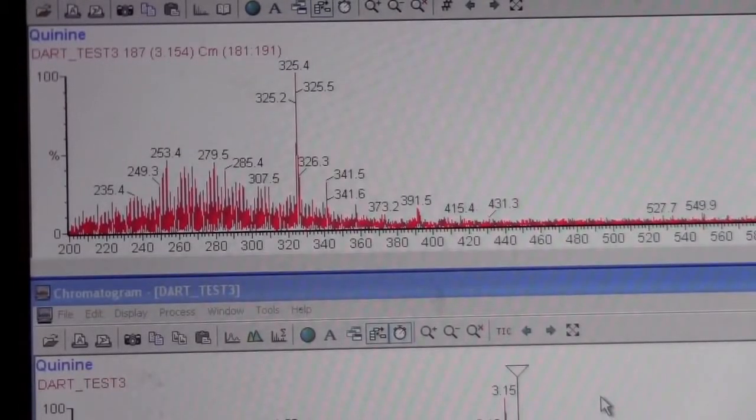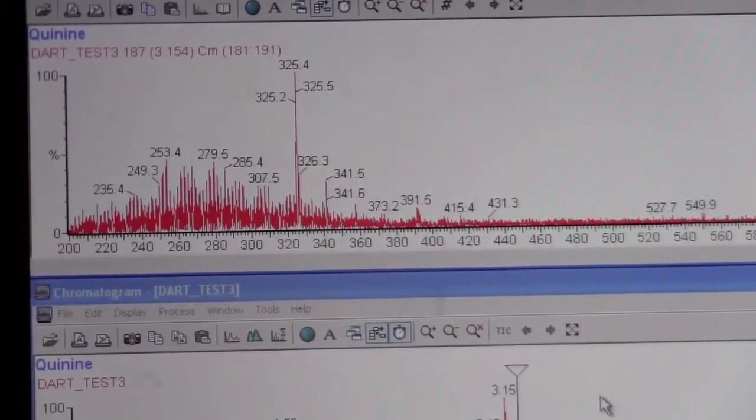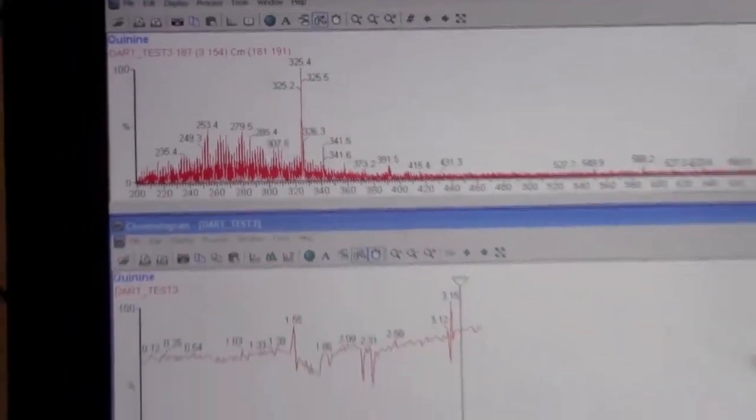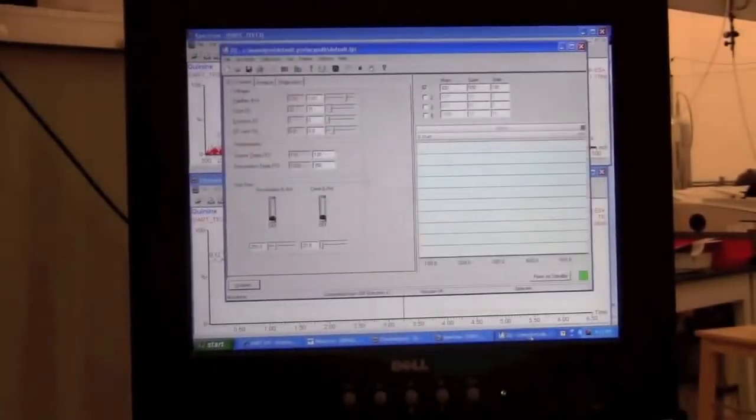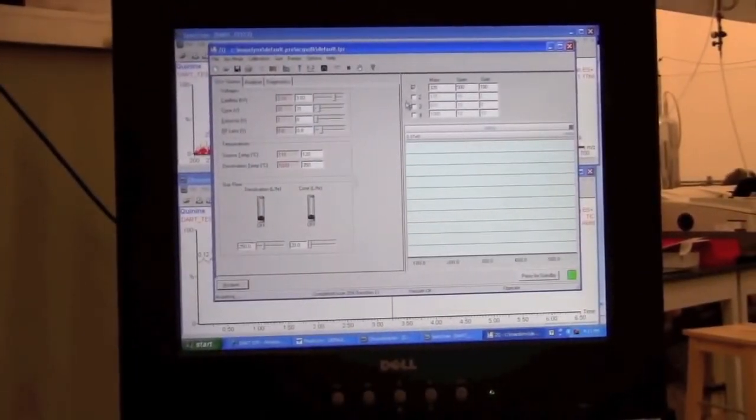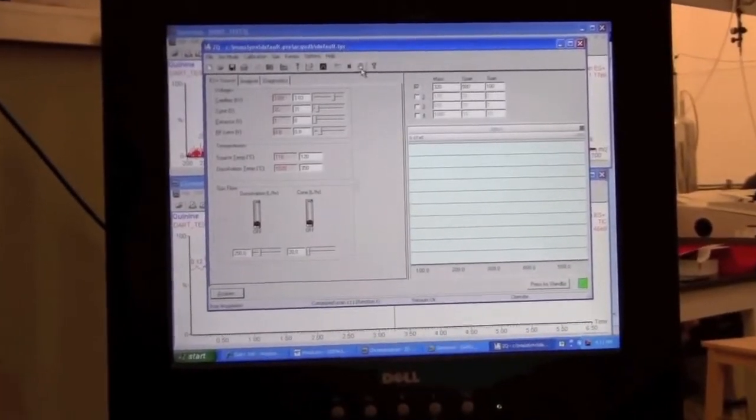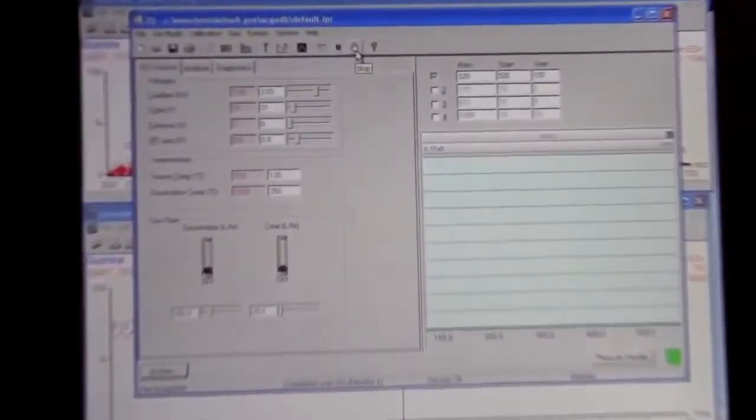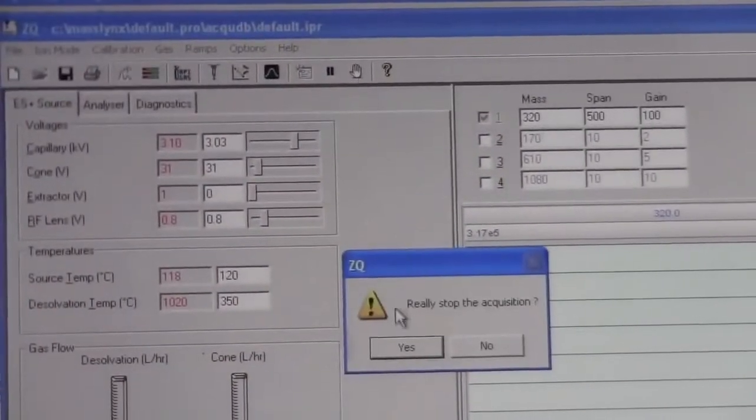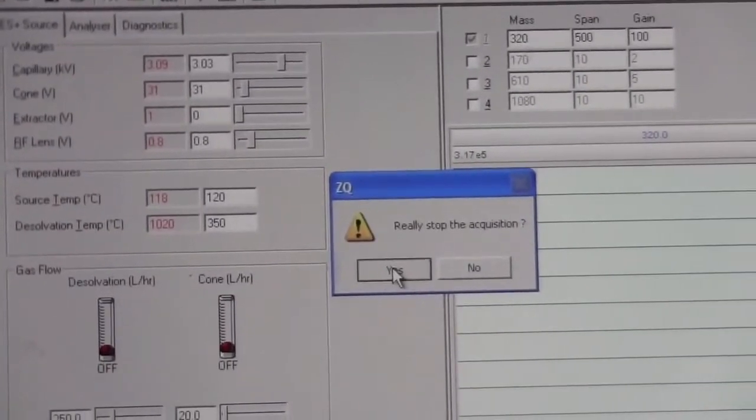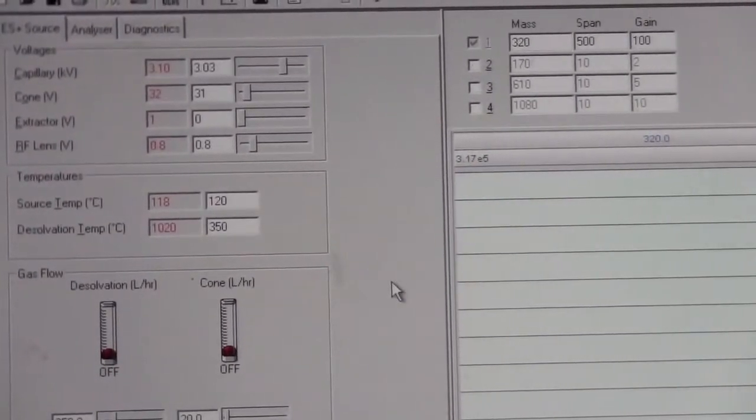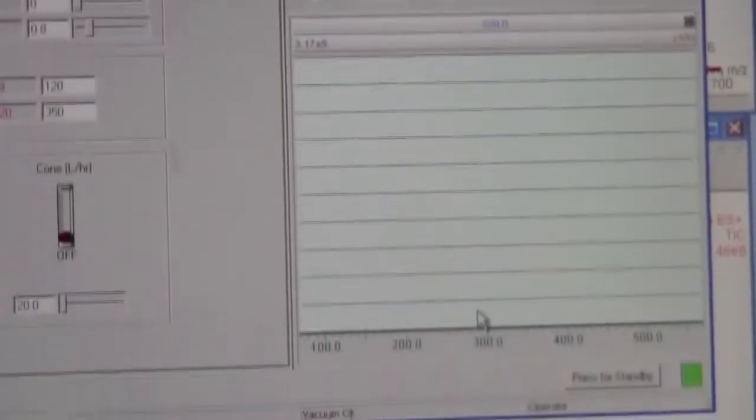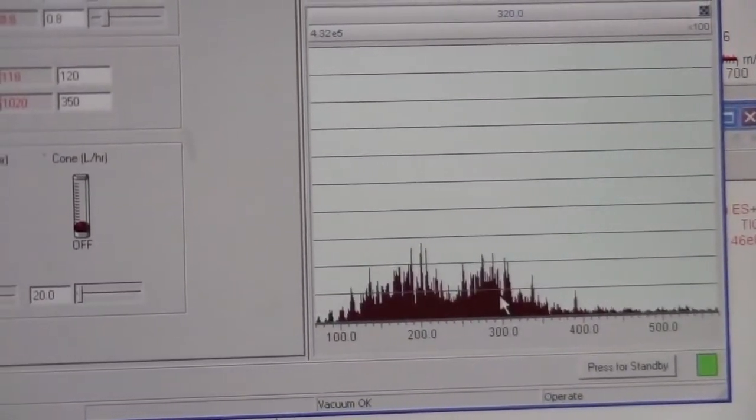When you're finished, what you should do is go back to the tune page. If you're done taking data, you can click on the hand to stop acquisition. Yes, you really want to stop acquisition. It should put it back where it's showing ions here. That's normal.